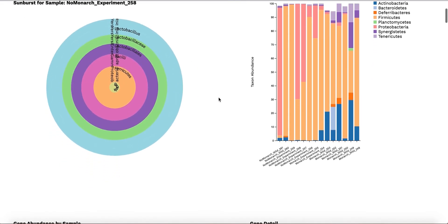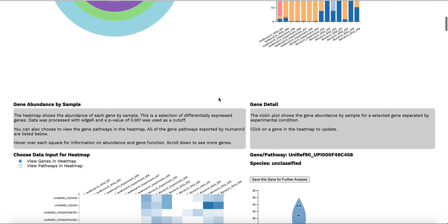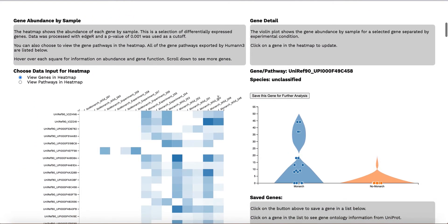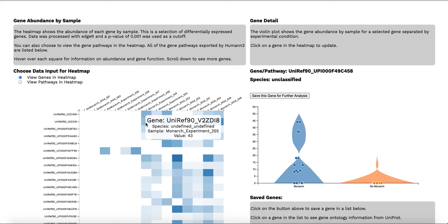The lower section of the visualization shows a subset of genes in the samples. The bottom left has a heat map which offers the user two options, either to look at genes in the samples or gene pathways.